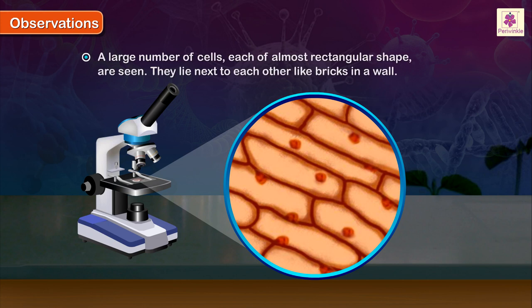A large number of cells, each of almost rectangular shape, are seen. They lie next to each other like bricks in a wall.